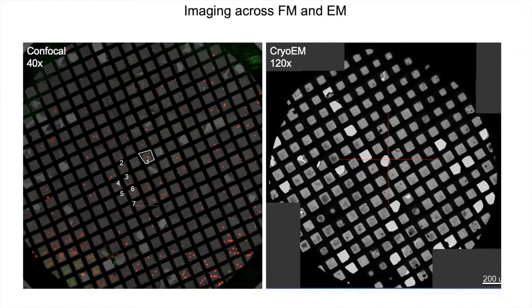I can tell you that the center is out here, and it's a square close to the center, right? So all you have to locate is a center in this image. So this could be the center.